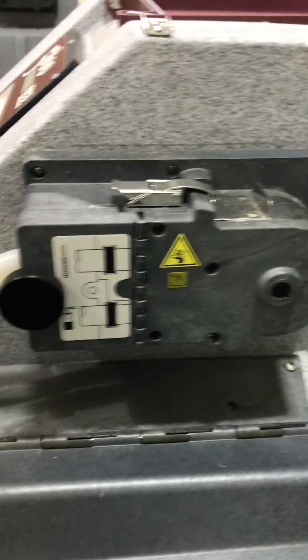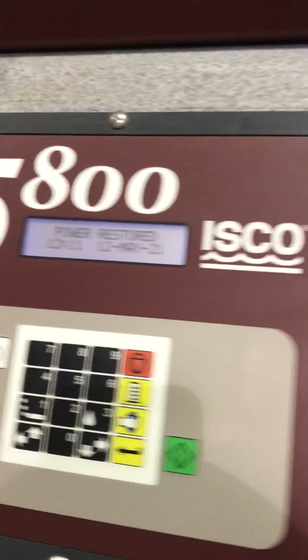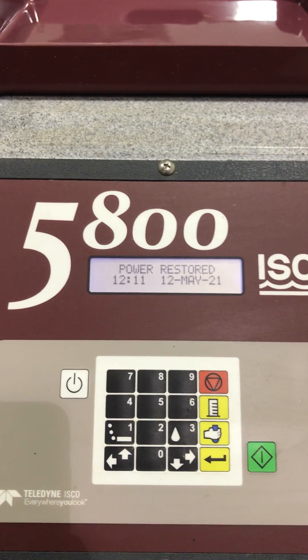It does show errors that the tubing is not connected, as you can see, which I assume could be resolved easily. It's just saying here: power restored.